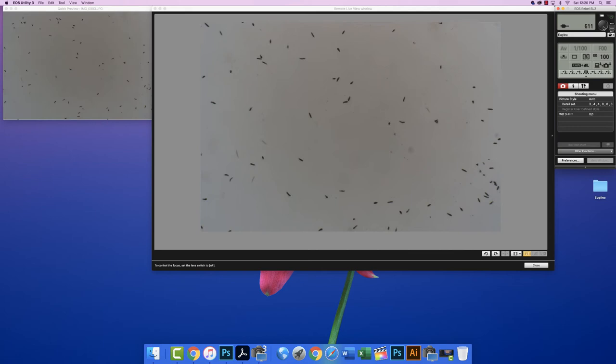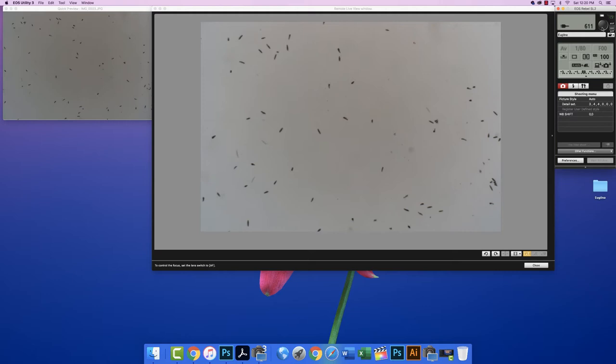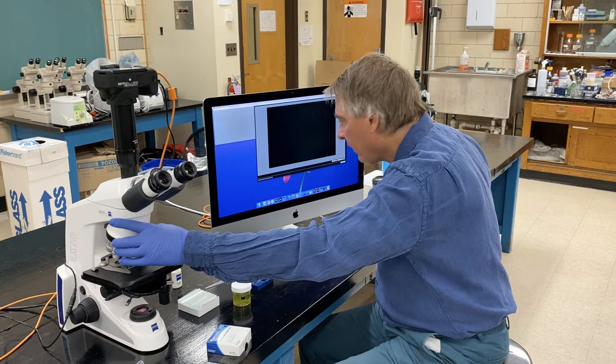It again looks a little dark, so I'm going to open up exposure compensation and open up a third of a stop like we did last time. And take another photograph. There we go. And let's just go up to 10x. And focus.